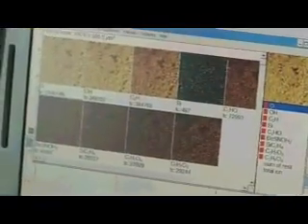But what this does then eventually is it gives us a spectrum, and you can see a spectrum that's coming out here, and basically each little peak corresponds to a particular type of material on the surface, and we can take that information and then map that on a surface and say what material is where, and that's critical in understanding how, for example, coatings of implants interact with our body.